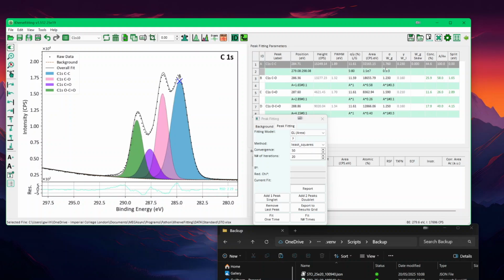Okay, so it's again similar to Casa. I think if you put a star or hashtag just like you would do in Casa, then it will know to propagate to all columns in this one, but you have also the right click menu.